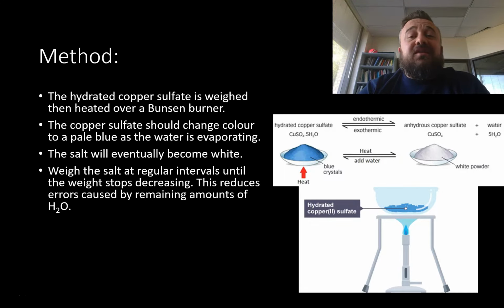And if we're doing something like, say, a magnesium salt with water, they'll tend to be white, and they'll stay the same color. So we can't always tell.